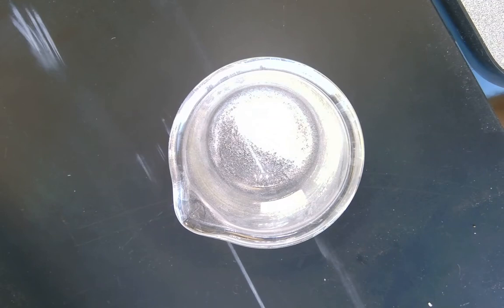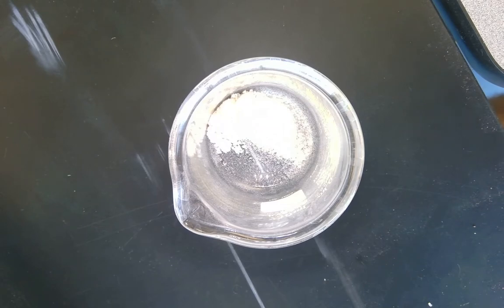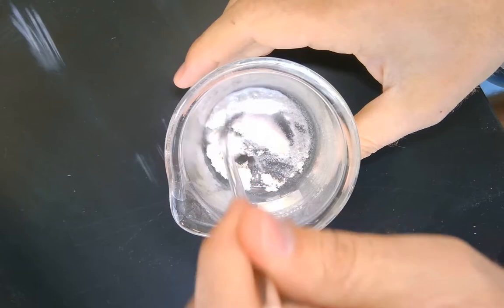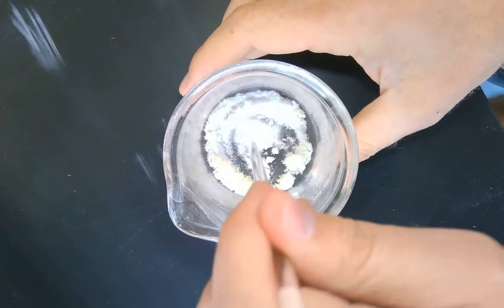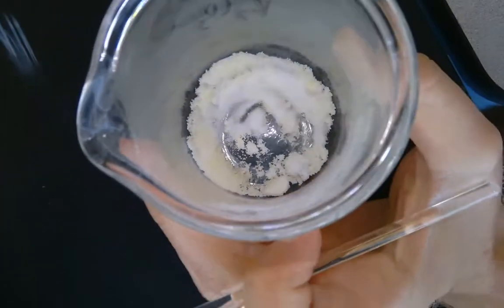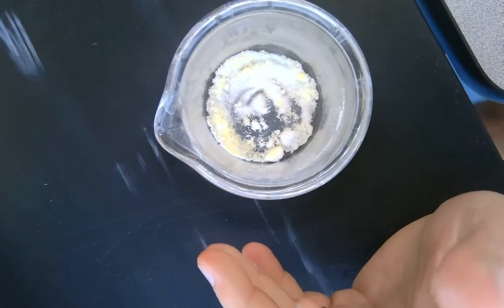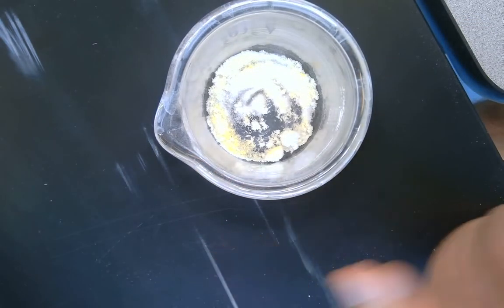That's actually quite a bit. And a little bit of the lead nitrate. So I dumped them both in there together. Now, if I stir them around, you might be able to make out that there is a slight color change there. I don't know how well you can see that. I thought a black background is easier to see than a light one.